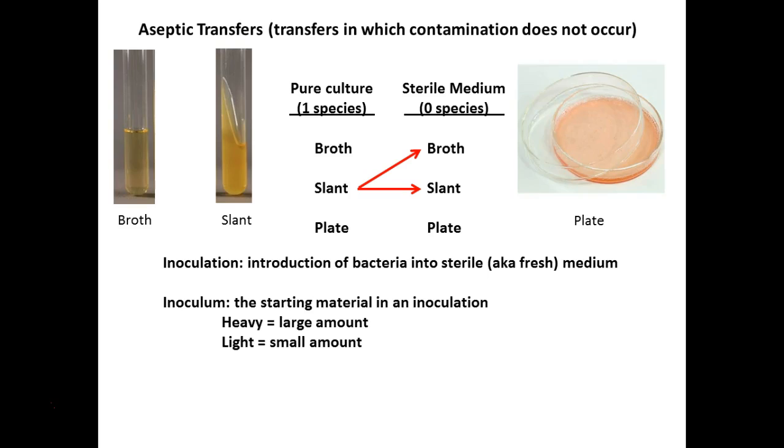Your loop is the instrument that you use, or you could use a needle. The loop, of course, has a loop at the end. And the needles, if people put them back in the correct place, are just that. Oh, this is the straightest needle I've ever seen in one of these. It's amazing. For certain techniques we'll use this. For some of you that can't figure out how to pick up a small amount, I'll usually say, why don't you switch to a needle instead of a loop? Because a loop is just not working for you, you're just picking up too much bacteria. And notice this loop too, this is a beautiful bend.